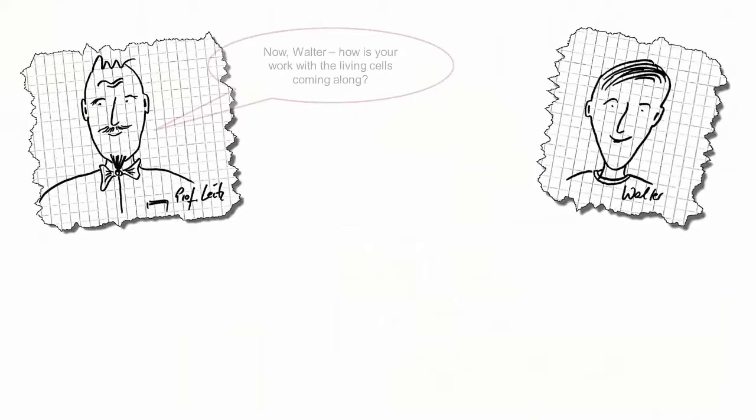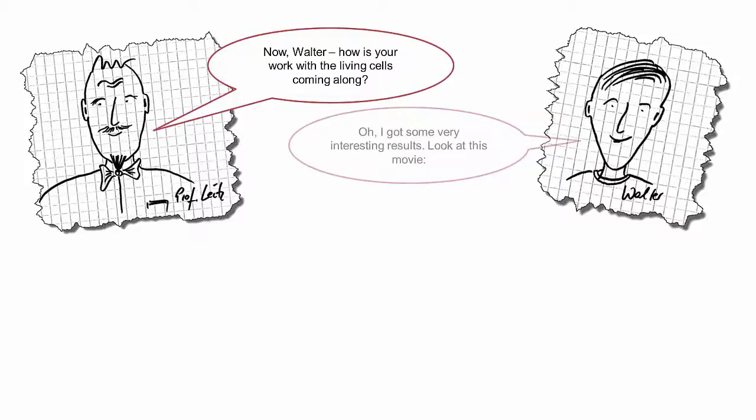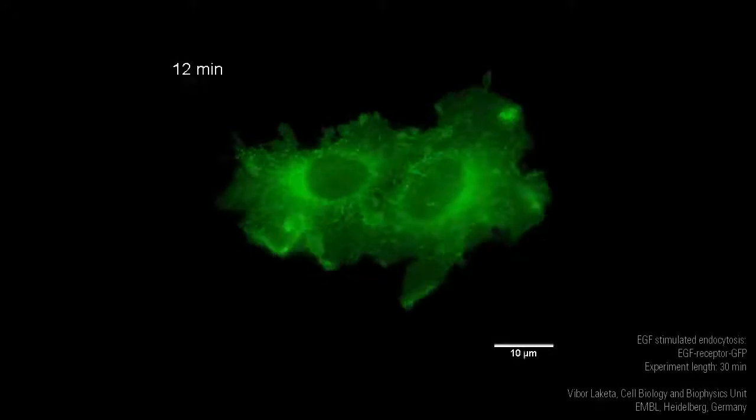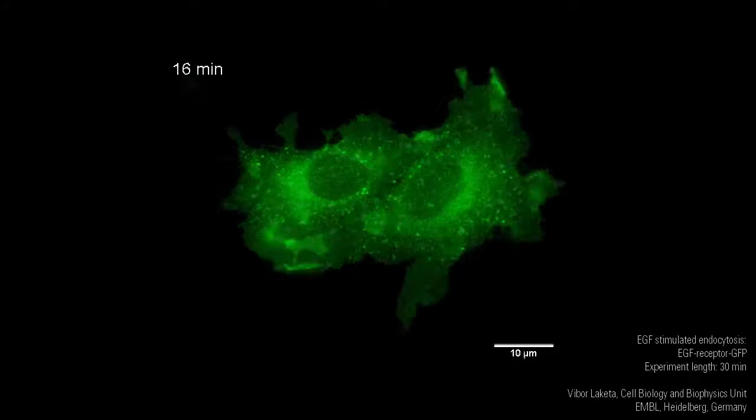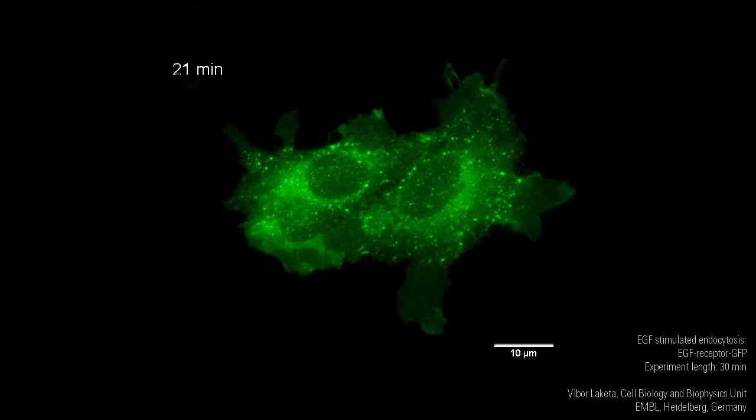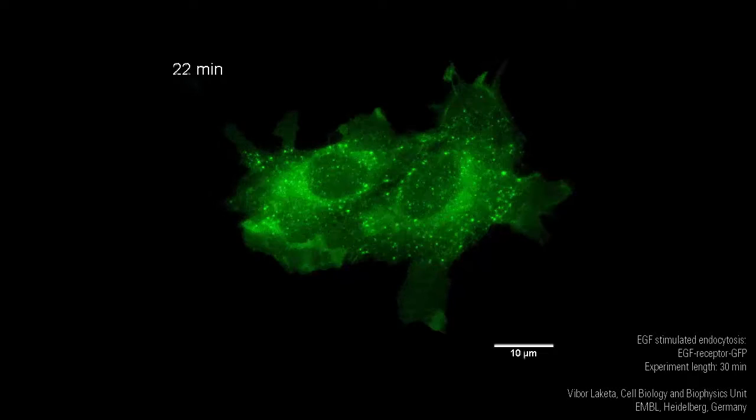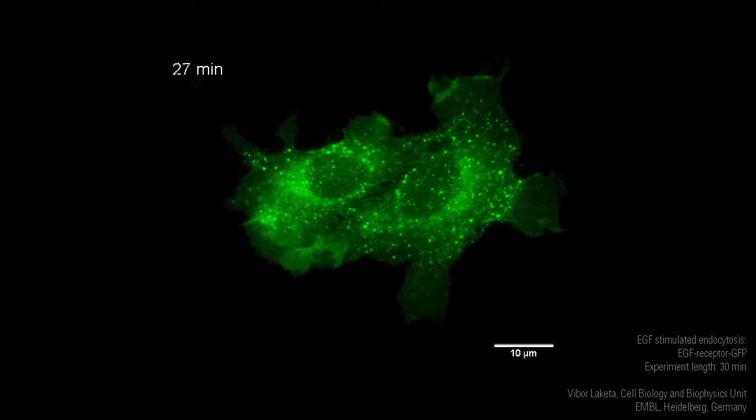Now Walter, how is your work with the living cells coming along? I got some very interesting results. Look at this movie. Shown here is a time-lapse movie of EGF-stimulated endocytosis in cultured cells. Over the course of 30 minutes, single vesicles take up the GFP-stained receptors and appear as bright puncta.